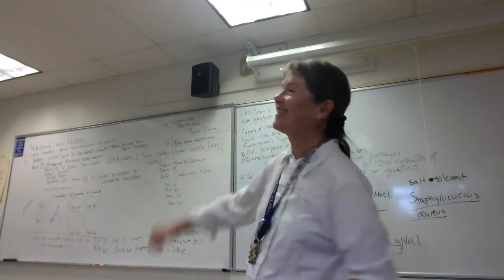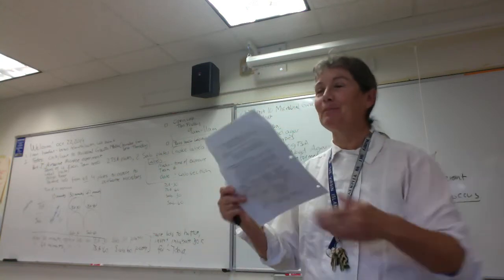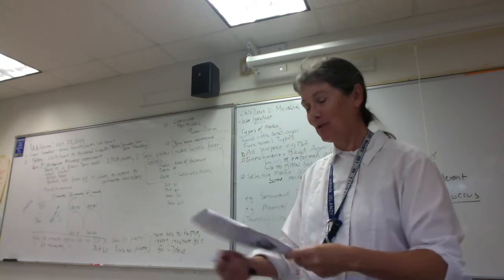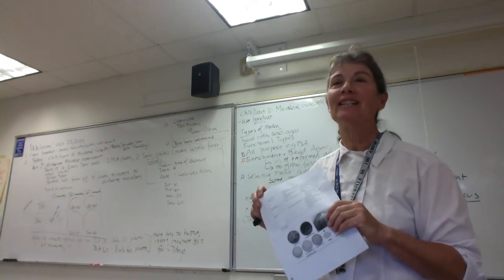Good. Oh, that's great. We should do that. Every lab, every lecture, we should have a little break. Okay, I know that might be ugly if I'm up here dancing. Okay, we won't do that. So you guys, you need a minute or two just to put the lids on your plates.